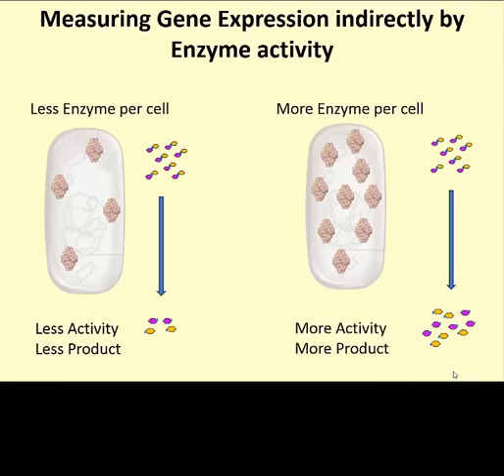Now, let's move on to the actual lab. How is the expression of lactose metabolizing genes actually studied? Shown here on the left might be a representation of a cell without induction. Lactase is at a basal level. On the right, we are looking at an induced cell with 100 times the amount of lactase. In the lab, we will primarily use lactase activity as a readout or representation of the lac gene expression, so we will be measuring the enzyme concentration indirectly by its activity.